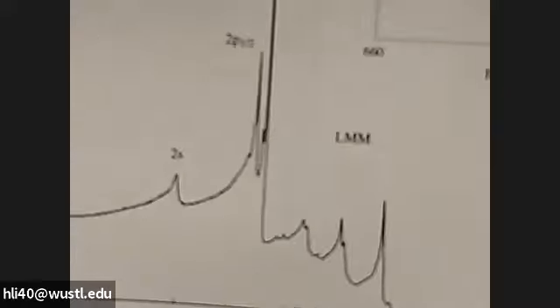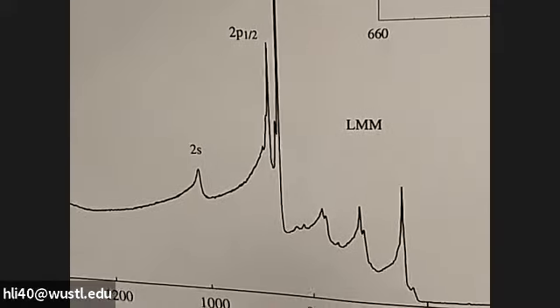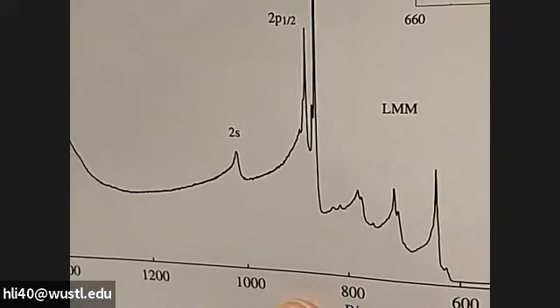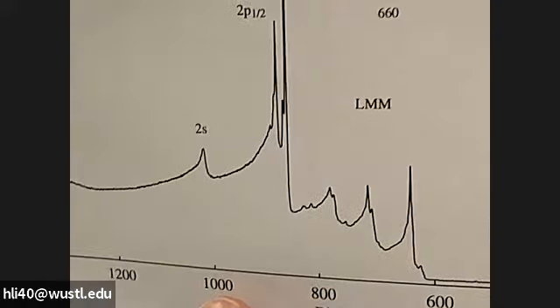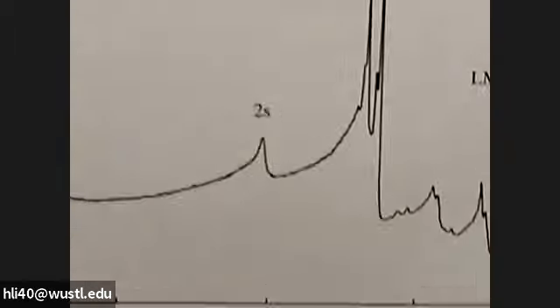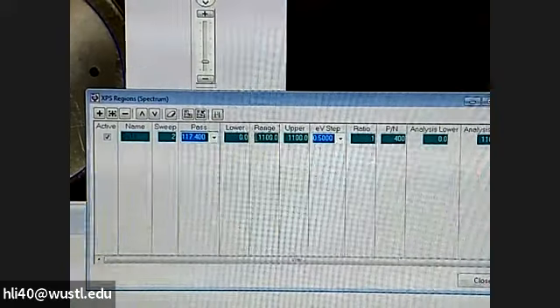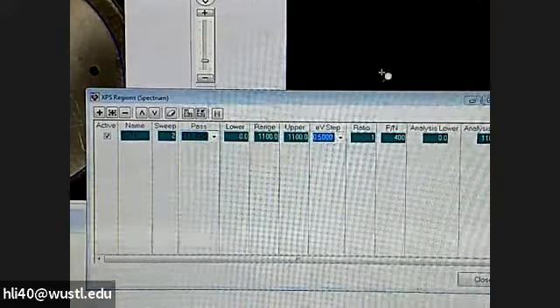I maybe have nickel. If you look at nickel, you see a spectrum. The highest peak is about 900, 900 something, below 1,000. But if you happen to have a peak at about 1100, we need to make sure the range can cover the peak you're interested in.